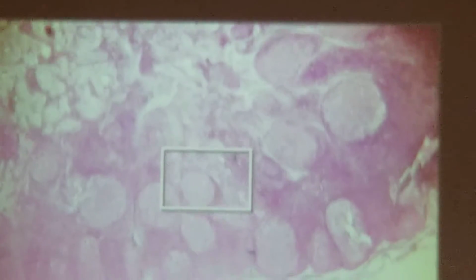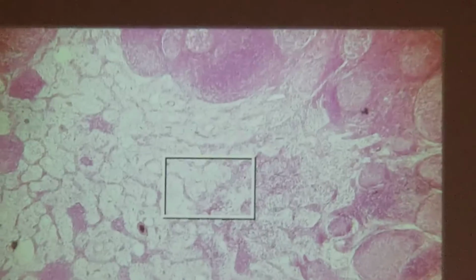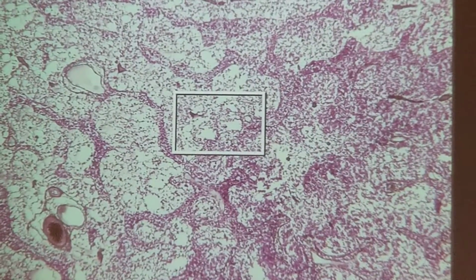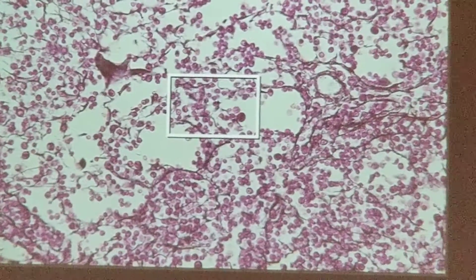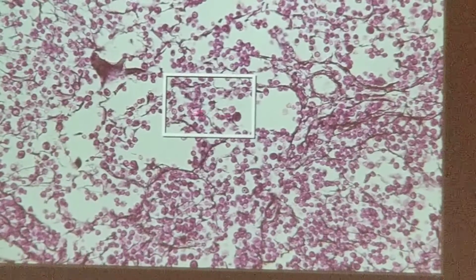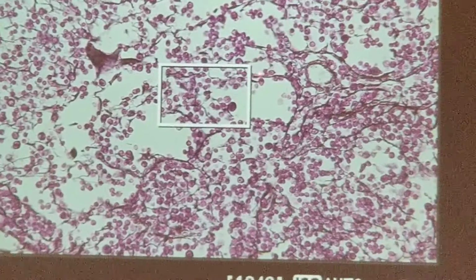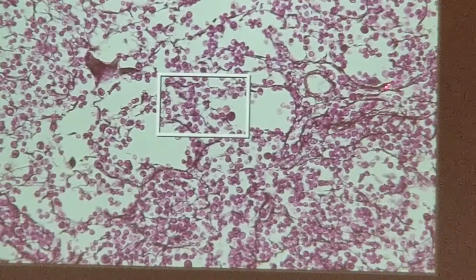Now, as we go into here, now we get into the reticular. So I would go not into here where it's real white, but where it transitions a little bit. It starts to get a little darker. You go to there. And this one is going to look like our holly berries, like little berries attached to the branches, right? So now you focus it in, and there you go, all right? So, each one of these little things are the actual reticular cells. And all these little branch-like structures that are dark here would be the reticular fibers.